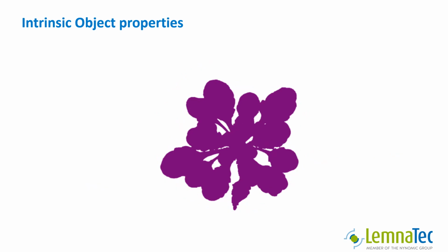All these properties have one thing in common. They depend only on the shape and size of the object itself. Therefore, we do not need to add any further information to get the intended results.